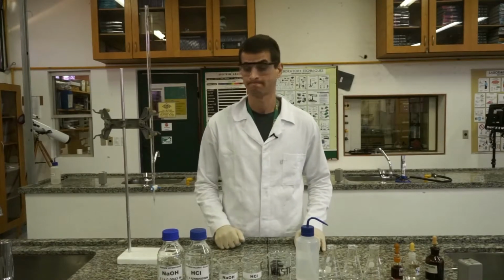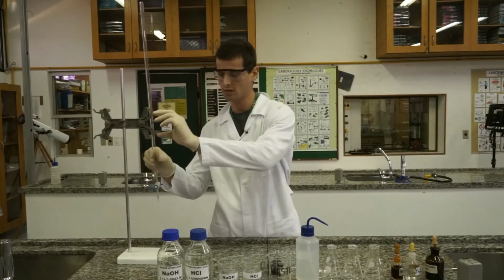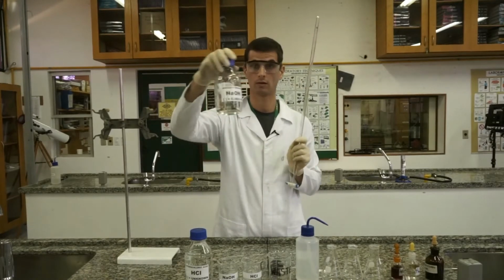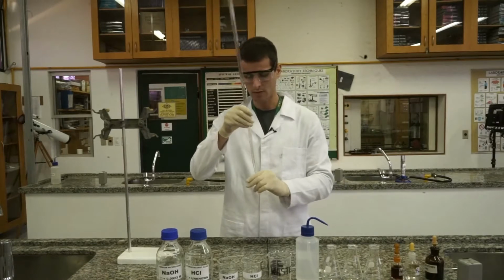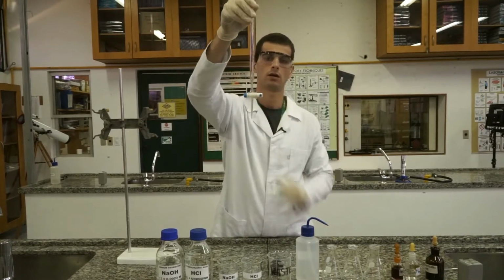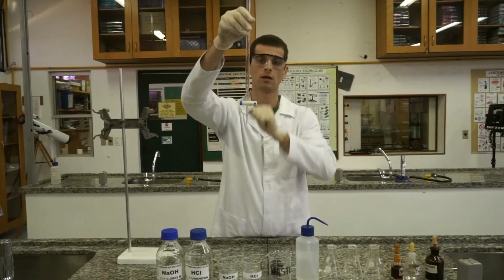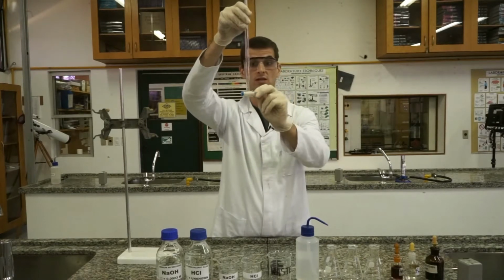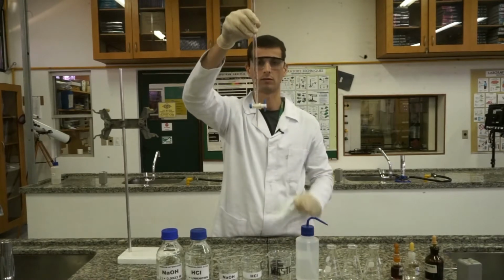Let's start. The first step is to fill the burette with sodium hydroxide, which will be the TITRANT. Guys, just to remember, if the stopcock is perpendicular with the glass, it's closed. If it's parallel like this, it's open.